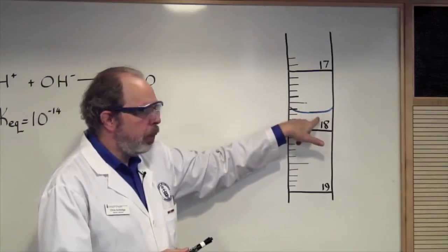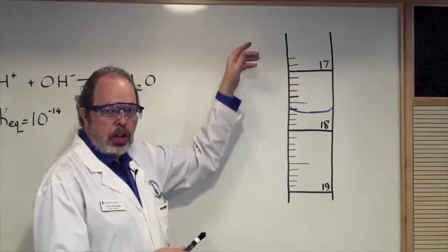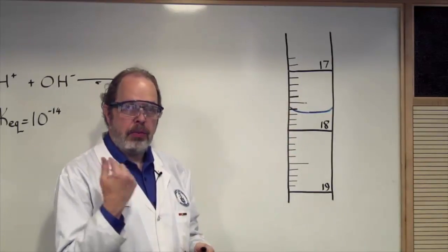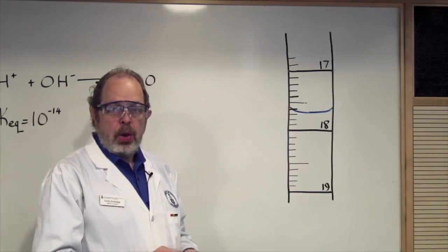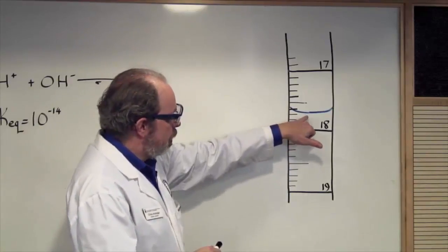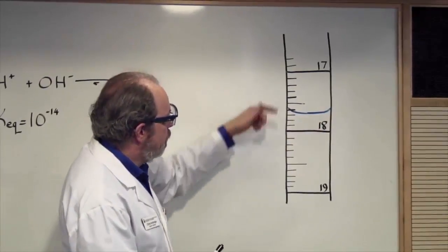So in this case, if this is the liquid in the burette, you should put your eye here. You shouldn't have it down here or up on top. You want to look and see that the ring is, in fact, a straight line to your eye. You are aiming to read the bottom of the meniscus here.